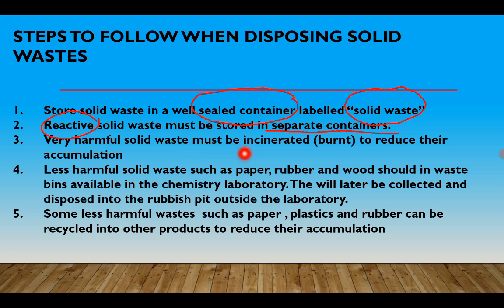Because if you don't burn them, they'll accumulate and pose a very serious danger to you and your colleagues in the laboratory. So take them to a place where they can be burnt. You don't burn them right there in the lab, no. There is a designated place where wastes are to be burnt.